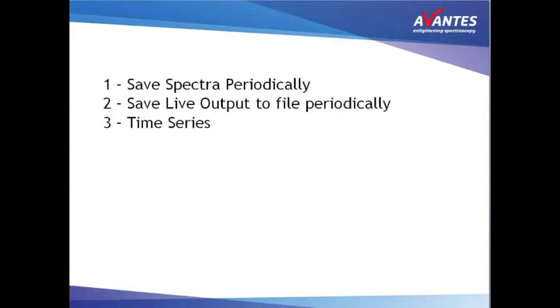there are multiple ways to proceed. You can use save spectra periodically, save live output periodically, or you can use time series. This video will describe the basics of time series.